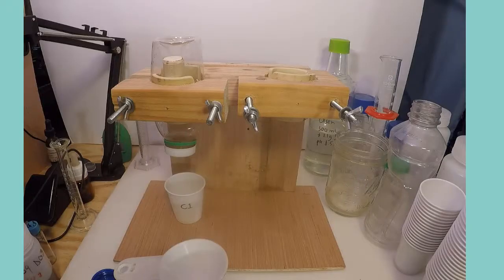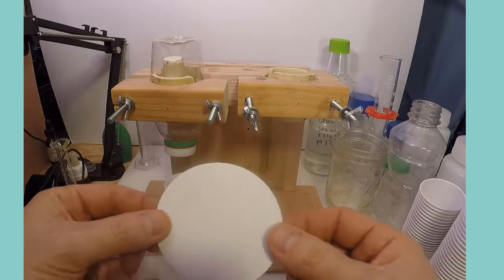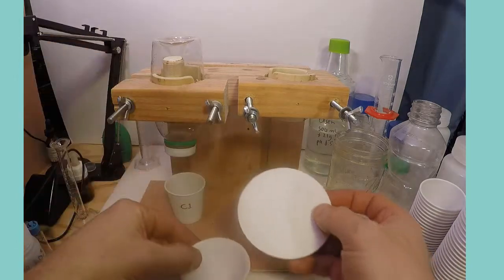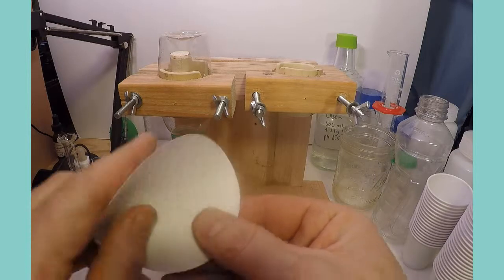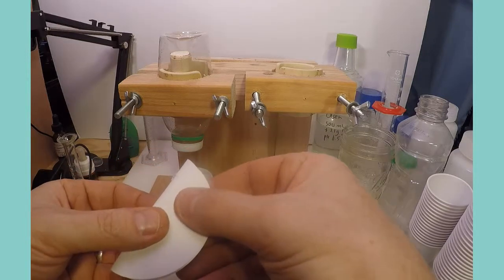To filter the suspension in a traditional way with filter funnels, a 90mm or larger filter circle is folded carefully into a funnel. The soil suspension is then transferred to the funnel.